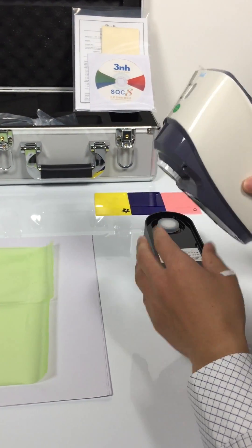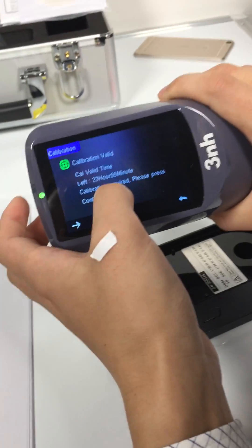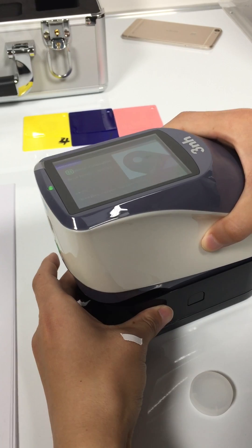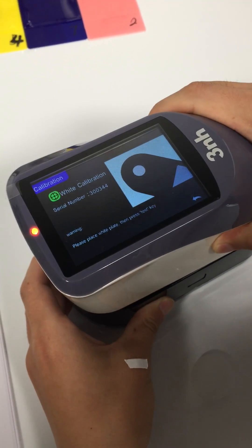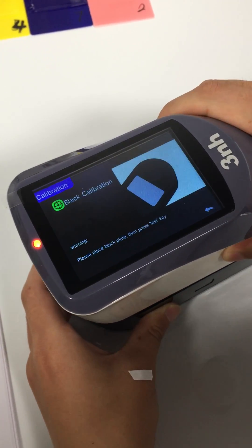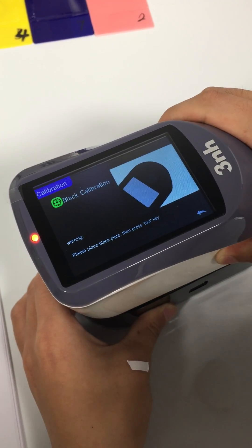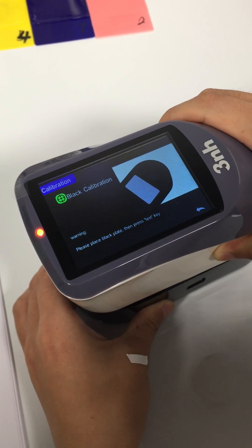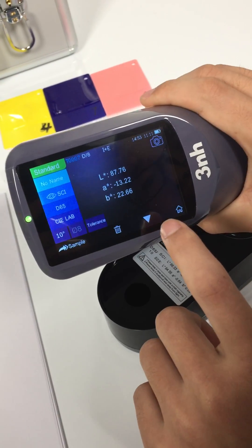First calibration — white calibration and black calibration. Okay, it's ready for mirroring.